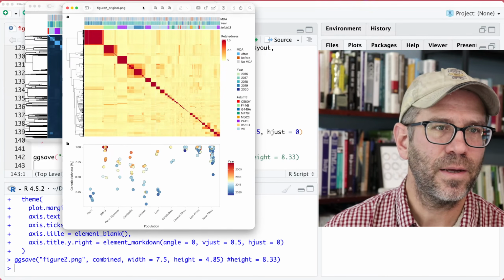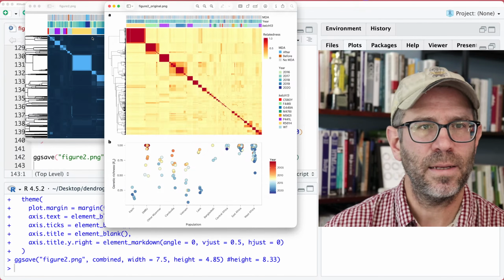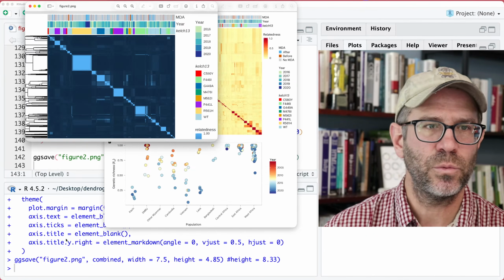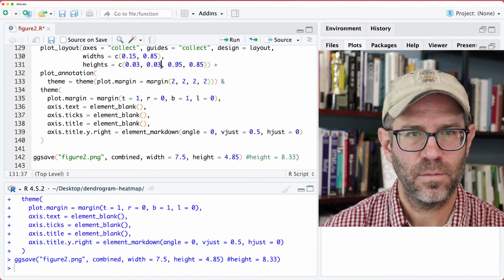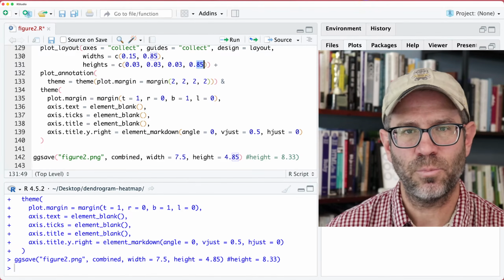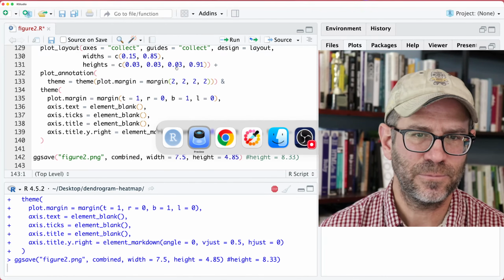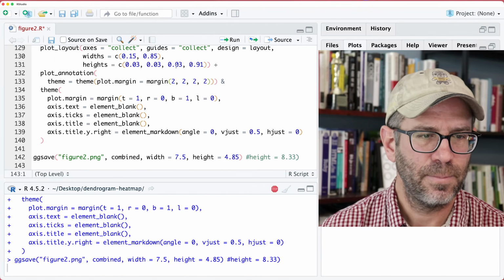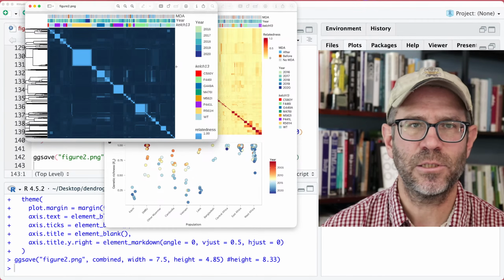And so if I compare those, mine again, I think is still too thick. So let's go to like 0.03. And so that would then make this 0.91. And if that's not right, I'll probably just be content to stop there. Yeah, I think that's good.